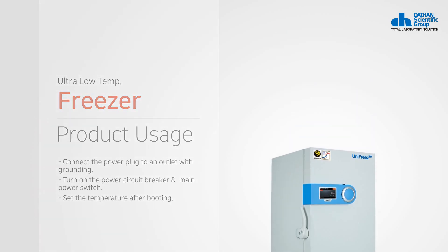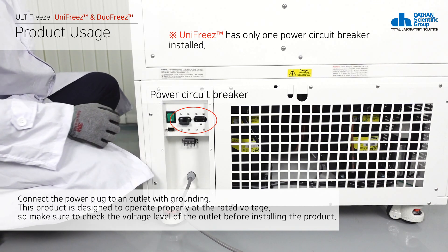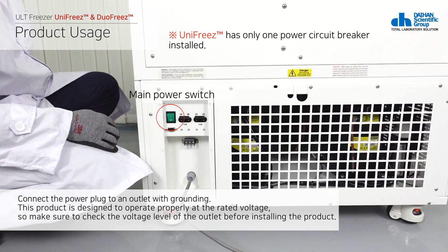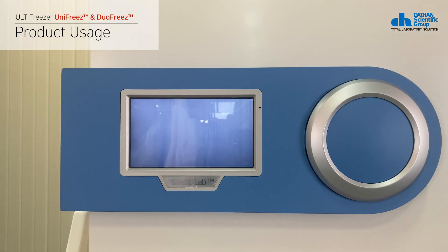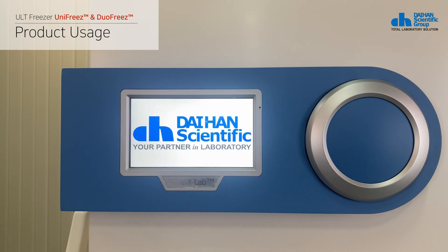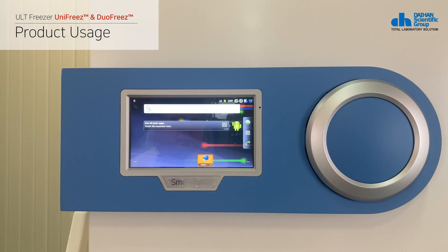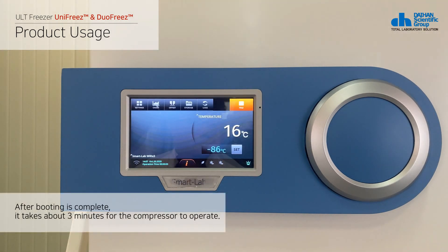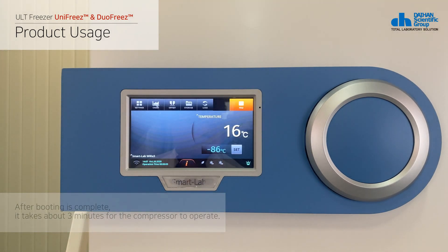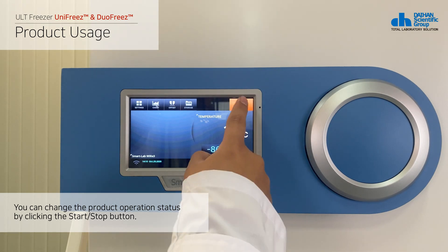This is how to use the product. Connect the power plug to an outlet with grounding, then turn on the product in the sequence of the power breaker located on the back of the product and the main power switch. Check the power status of the front touch controller and wait for booting to complete. You can change the operation status by clicking the start/stop button at the top of the screen.